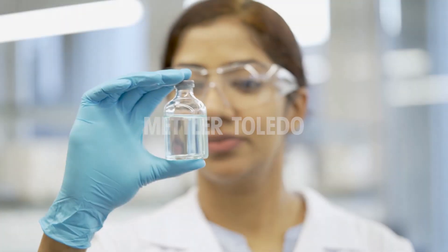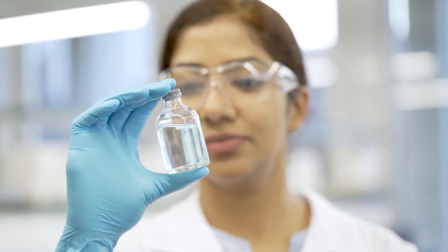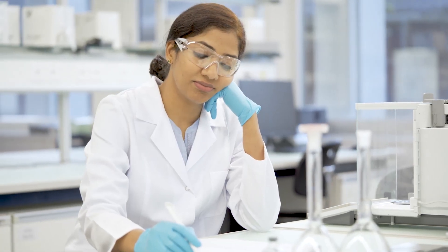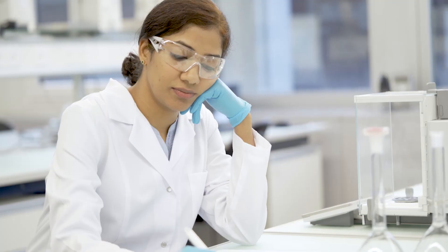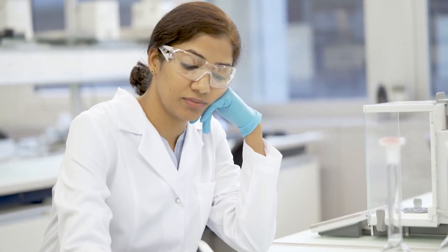Do you determine the water content of your samples? Do you find that your current measurements take too long? What if there's a better way to measure that delivers fast results without compromising accuracy? Want to learn more?